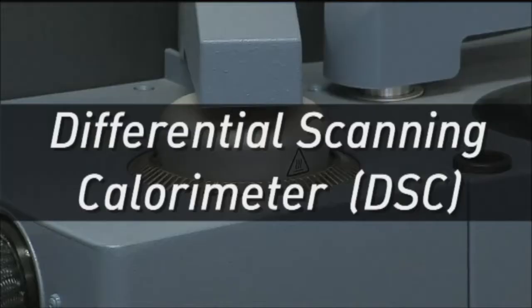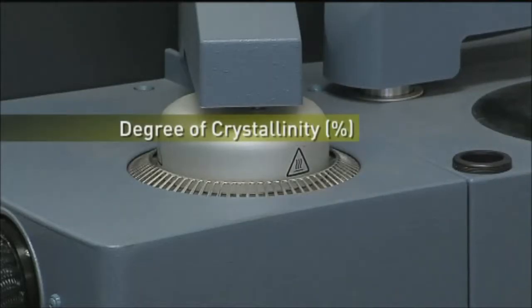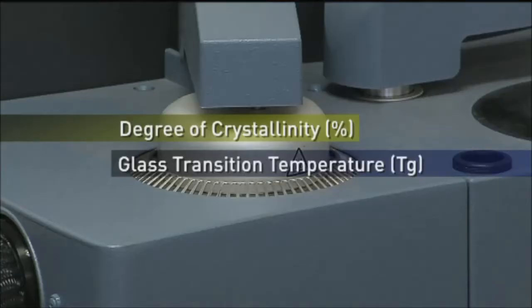The differential scanning calorimeter, DSC, can be used to measure a number of characteristic properties of a polymeric sample. Using this technique, it's possible to get crystallization events as well as glass transition temperatures and the degree of curing of the polymers.